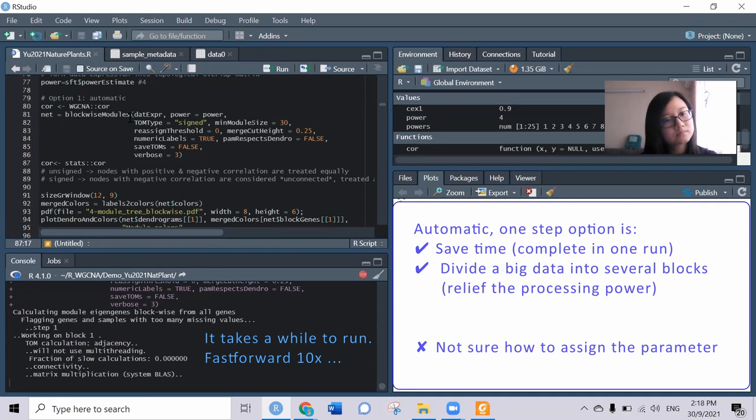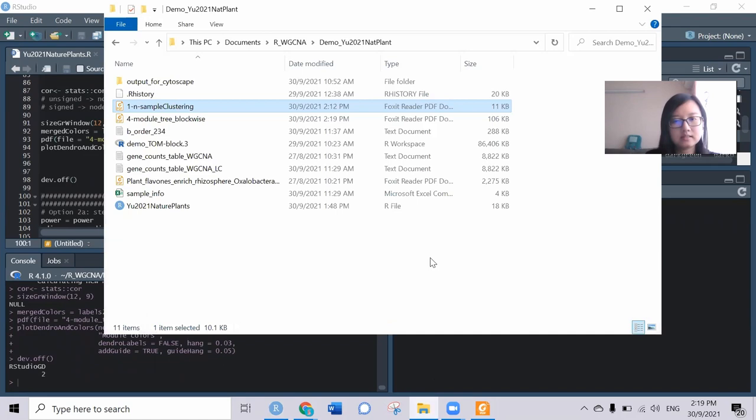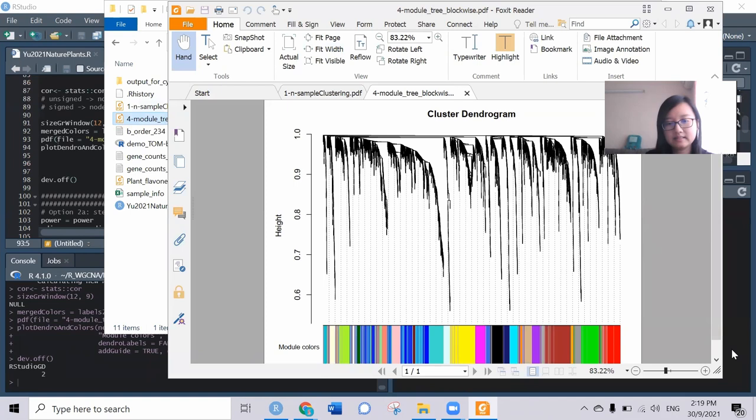Now I try to plot the dendrogram to see how this looks like. This is the dendrogram, and this is the module assigned here.